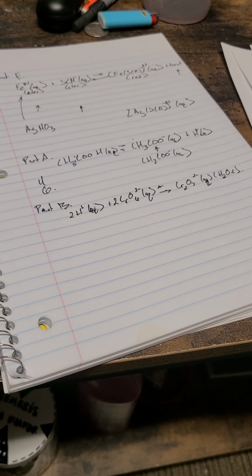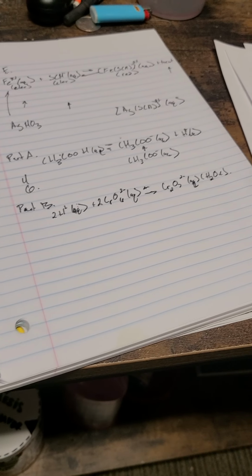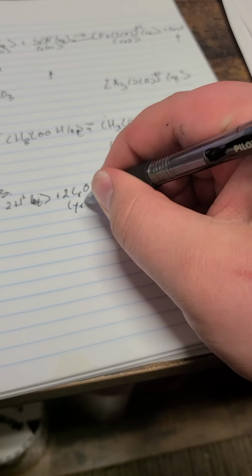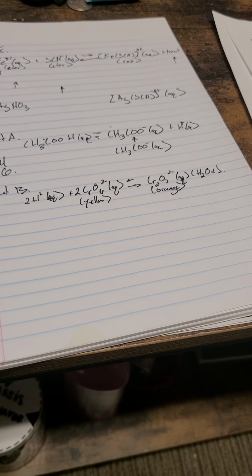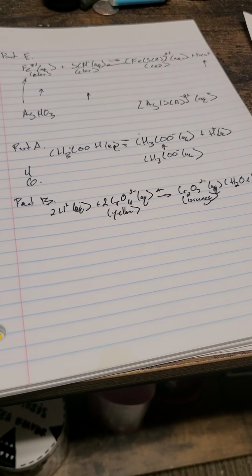CH3COOH. Part B is the chromate/dichromate equilibrium. CrO4 is yellow and Cr2O7 is orange. The original color is a light orange, signifying a proportional mixture of the two substances.